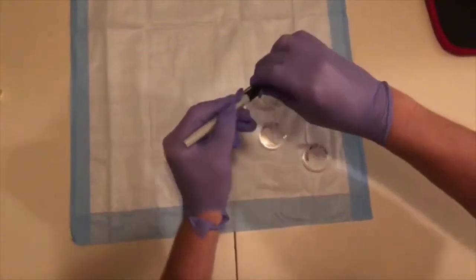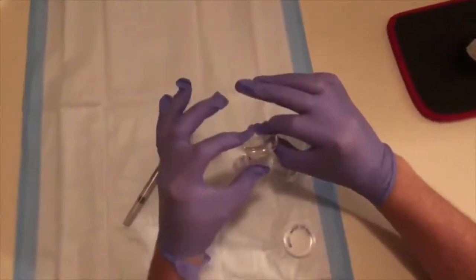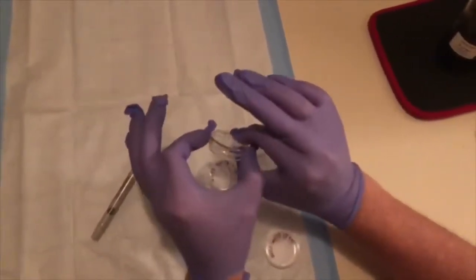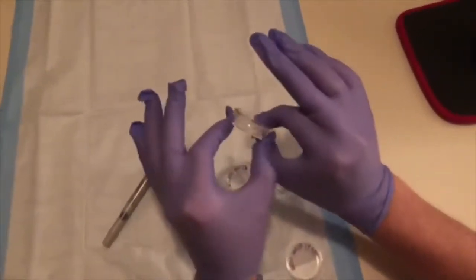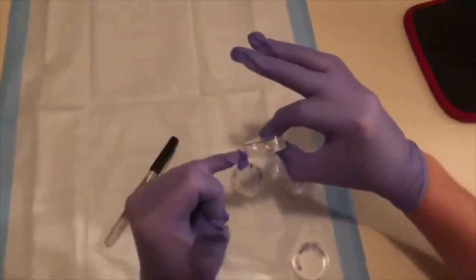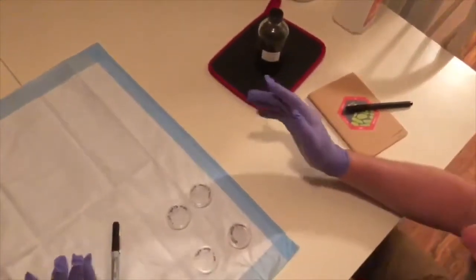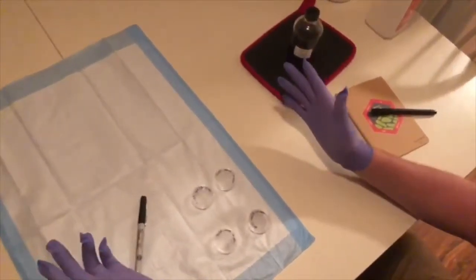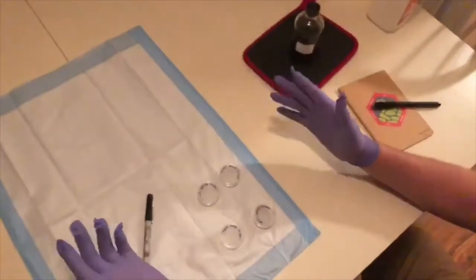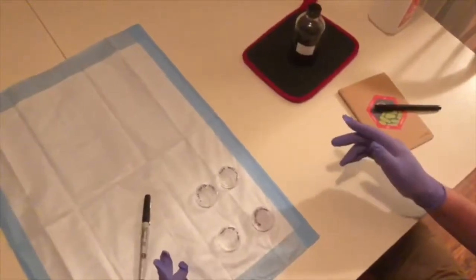The plates themselves have 2 parts to them. The top, or the lid, actually has a larger diameter, but it's shallower, and the base is a smaller diameter, but it's deeper. And there's a little ridge on these, and that's how deeply we're going to fill the plates. Now, I haven't mentioned the chuck. You may not have those in your kits. I have them, and it's just a convenient way to keep my surfaces clean. They're not sterile, but they're very clean, and it's rather absorbent. So if I have a spill, it just keeps things tidy.